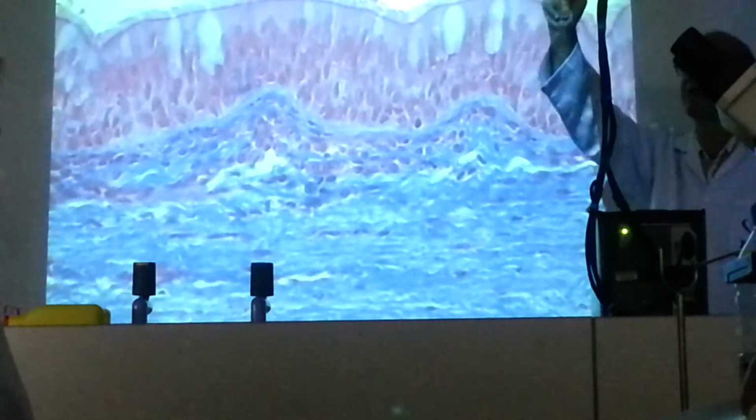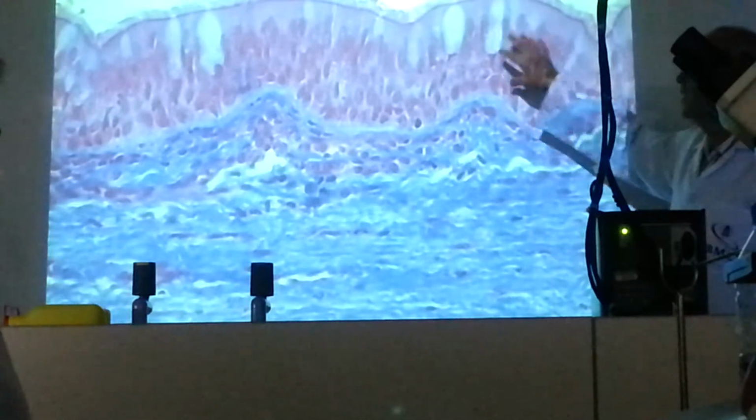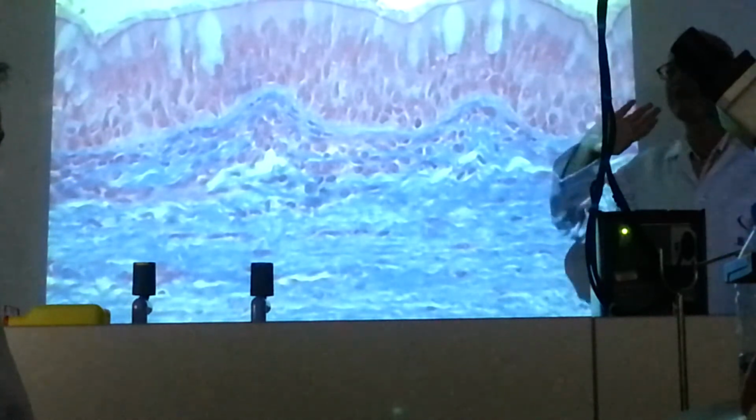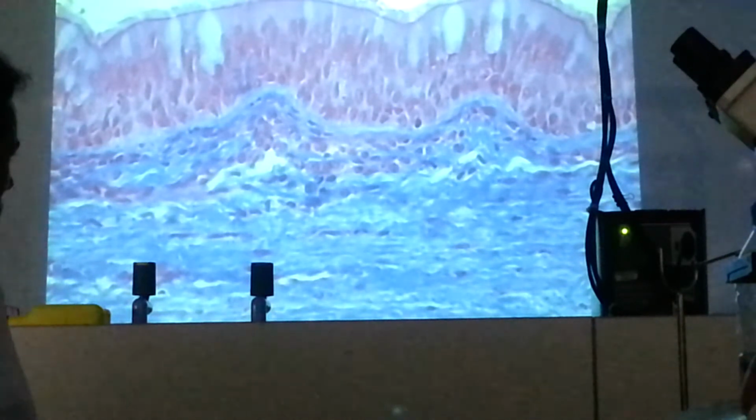Yes, you have a question? Again. Pseudostratified columnar ciliated with goblet cells. Another name is respiratory epithelium. 2 names for the same thing. Because you will not find pseudostratified columnar ciliated with goblet cells except in the respiratory tract, so we call it respiratory epithelium. You can say either name.